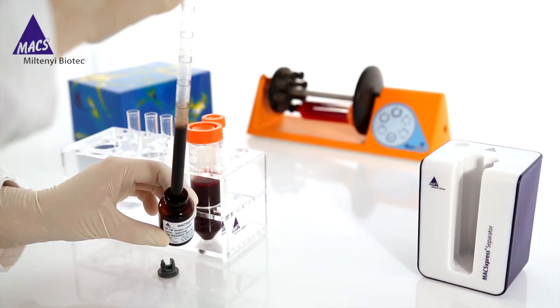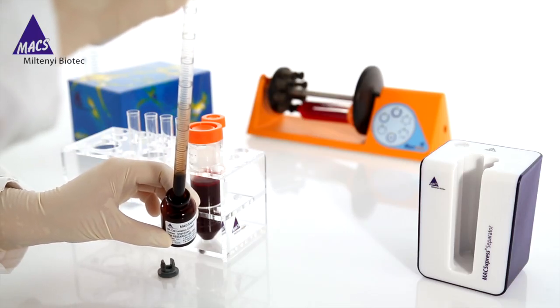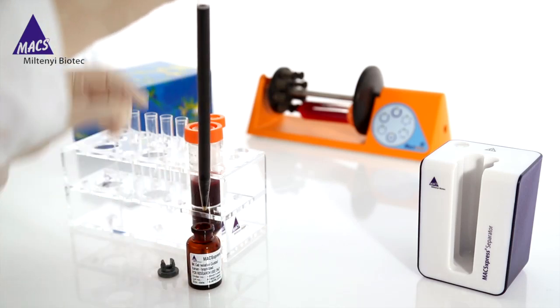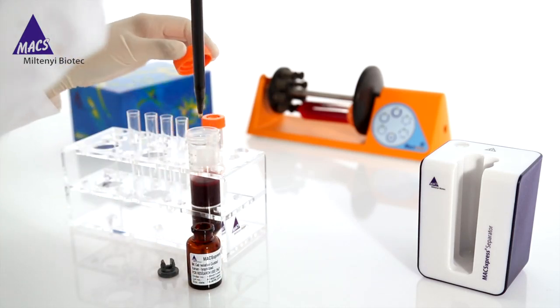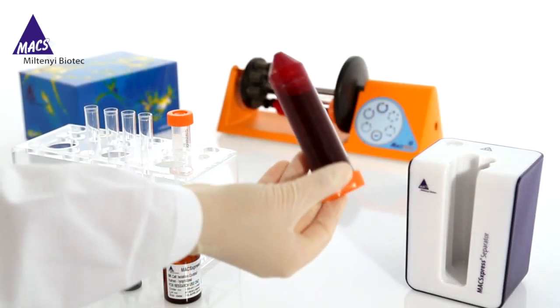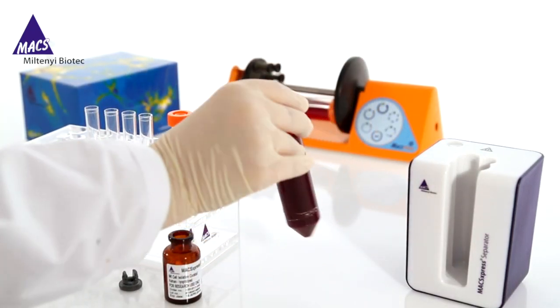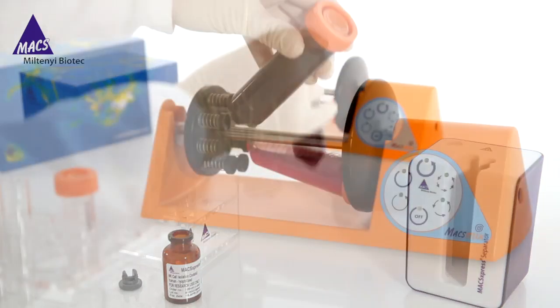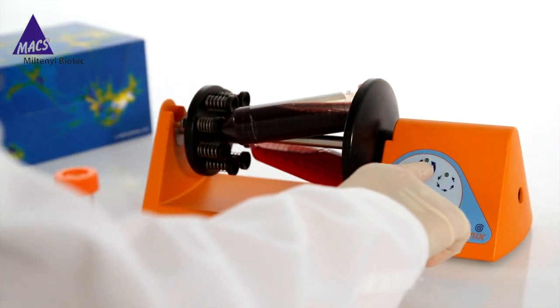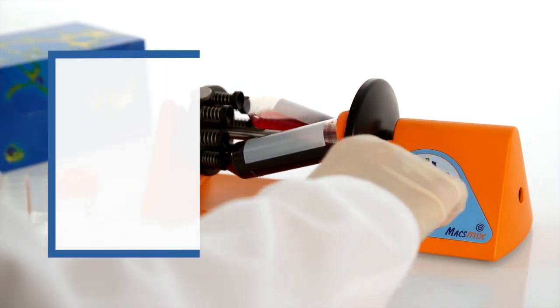Simply add the reconstituted MaxExpress cell isolation cocktail to anticoagulated whole blood. You can conveniently process up to 30 milliliters of whole blood in one go. Mix and incubate for five minutes in a MaxMix tube rotator. During this time the unwanted cells are labeled with MaxExpress beads. The target cells remain unlabeled.